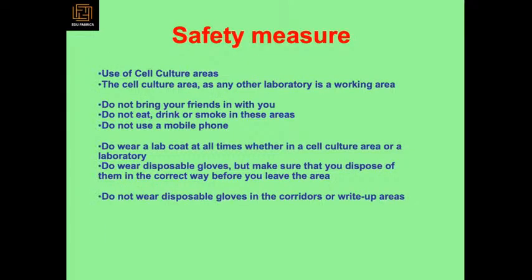Some of the safety measures: use of the cell culture area. The cell culture area, as with any other laboratory, is a working area. So do not bring your friends in with you. Do not drink or smoke in that area. Do not use your mobile phone also. Do wear your lab coat while doing your cell culture. And do not reuse your gloves, because your sweat and particles will be within your gloves. And after wearing the lab coat and gloves, do not move in the corridors, so that you do not carry the microbes present in the lab outside.